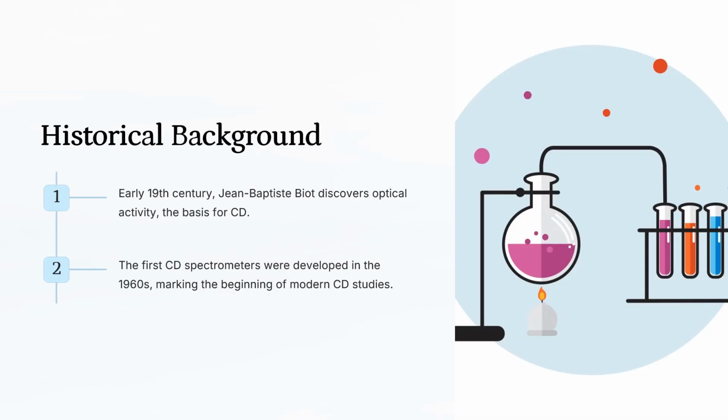Let's have a historical background. CD spectroscopy has its roots in the early 19th century when Jean-Baptiste Biot discovered optical activity. Later, advances in instrumentation led to the development of the first CD spectrometers in the 1960s. Today it is widely used in structural biology and pharmaceutical research.